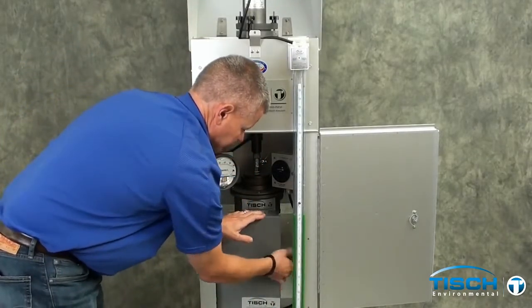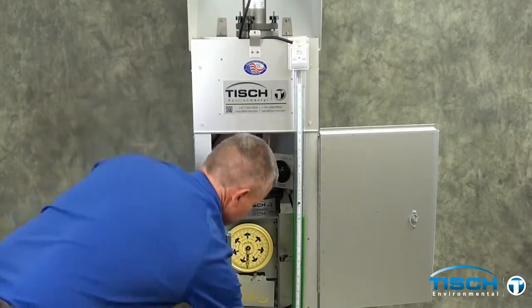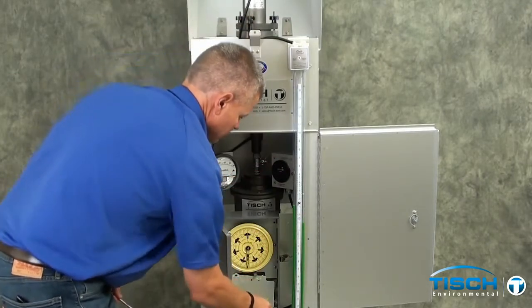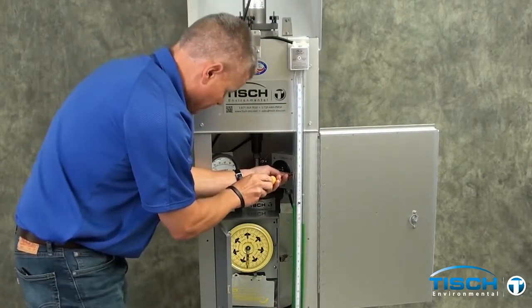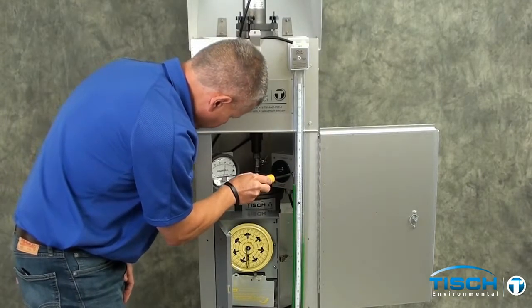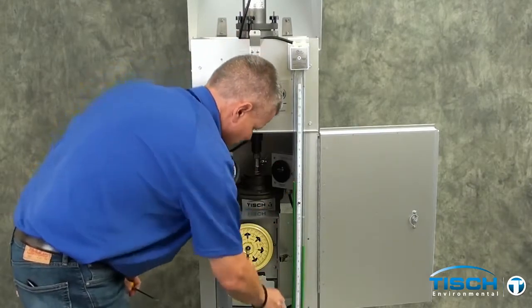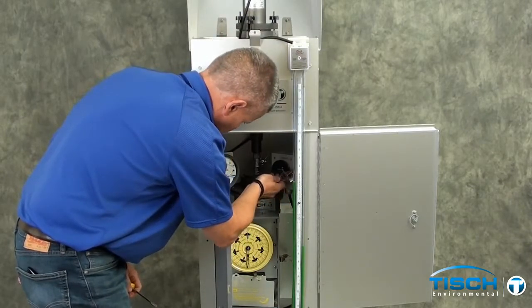You will need to turn on the air sampler. Open the door of the TE-507 timer and flip the switch to the right, turning it on. Loosen the shaft lock on the TE-5010 voltage variator and use a screwdriver to set the magne-helic gauge to 70. After obtaining 70 on the magne-helic gauge, tighten the shaft lock back up so it does not move.